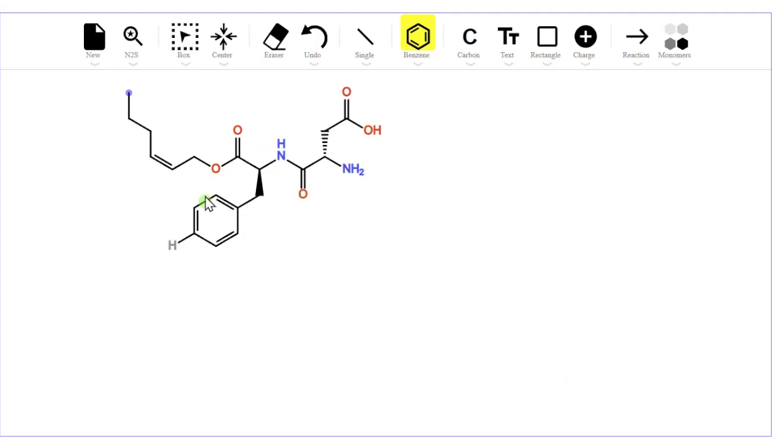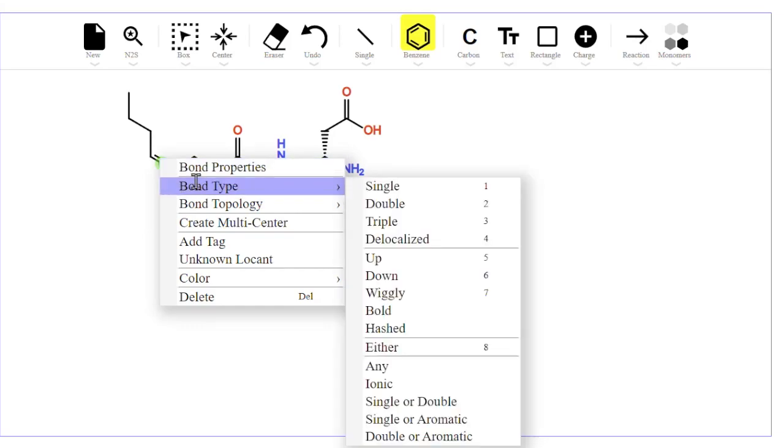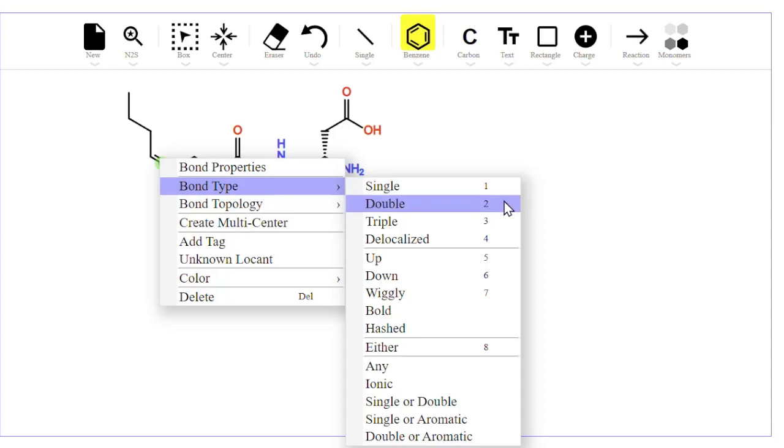For bonds, there are bond keyboard shortcuts. If I point and right click on a bond, you can see bond type. Typing 1 gives a single bond, 2 gives a double bond, 3 gives a triple bond, and 4 gives a delocalized bond.